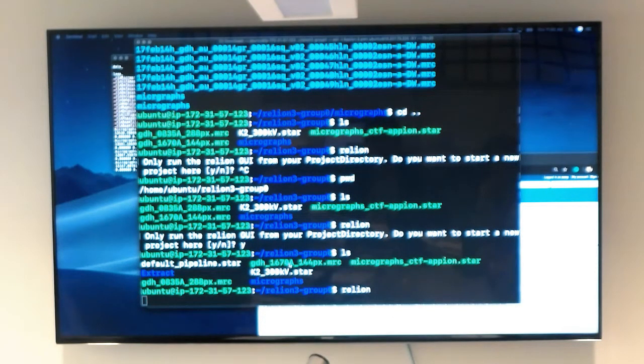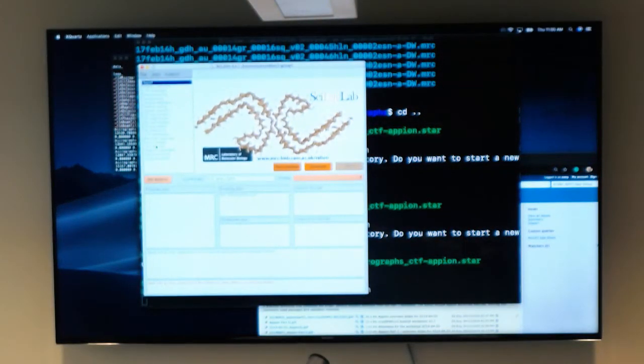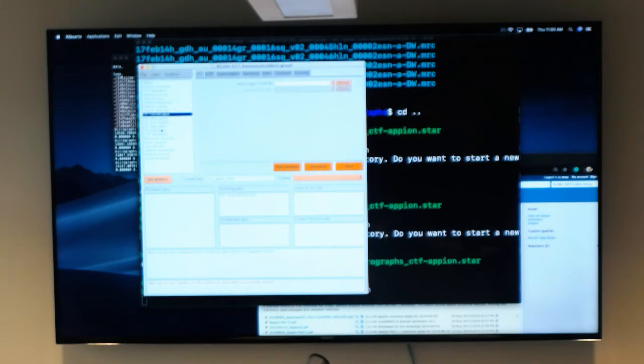Okay, so again, the tutorial is in front of you, and if not, you can go to the Redmine issue, and then I'm going to have you just start going as far as you can. The goal would be, after you extract some particles, to do 2D classification, and there are a few options within the tutorial for 2D classification, and when I go over the overview, I'll show you the results of both.